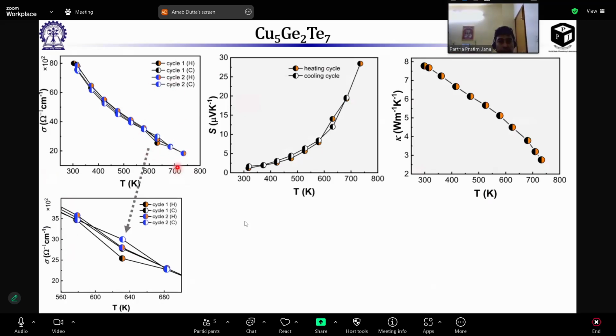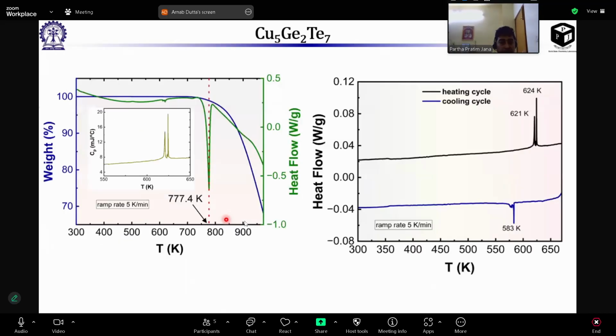So Kedar, after looking at the DSC data, one point I will add is that we have planned to go for temperature-variable single crystal XRD measurements. Then we could see what is actually happening above this particular temperature where the peak is shown. We will do that in future to look at whether there is any structural phase transition.